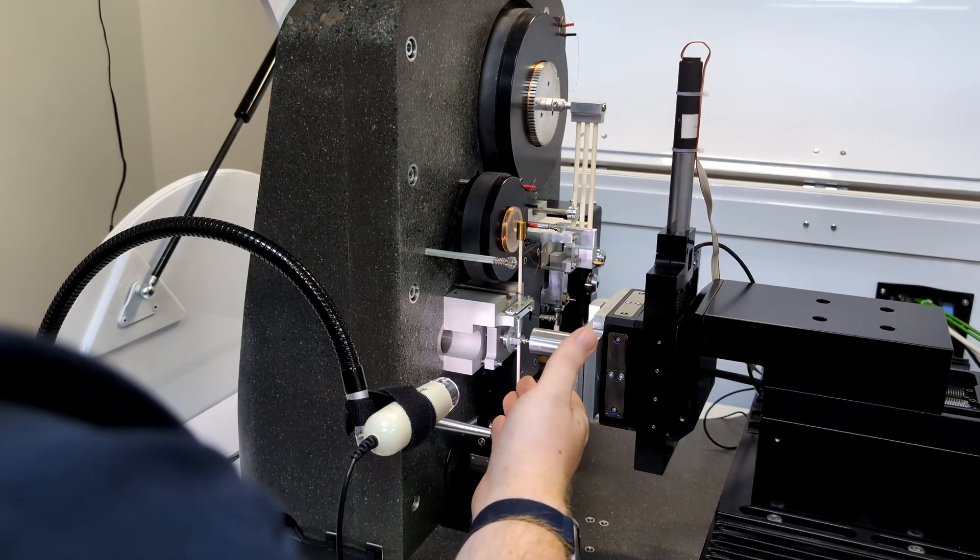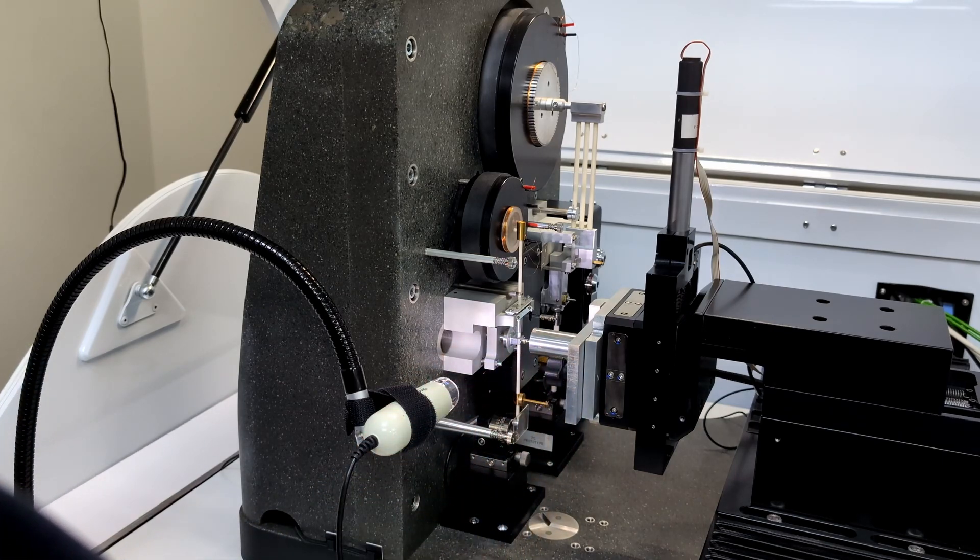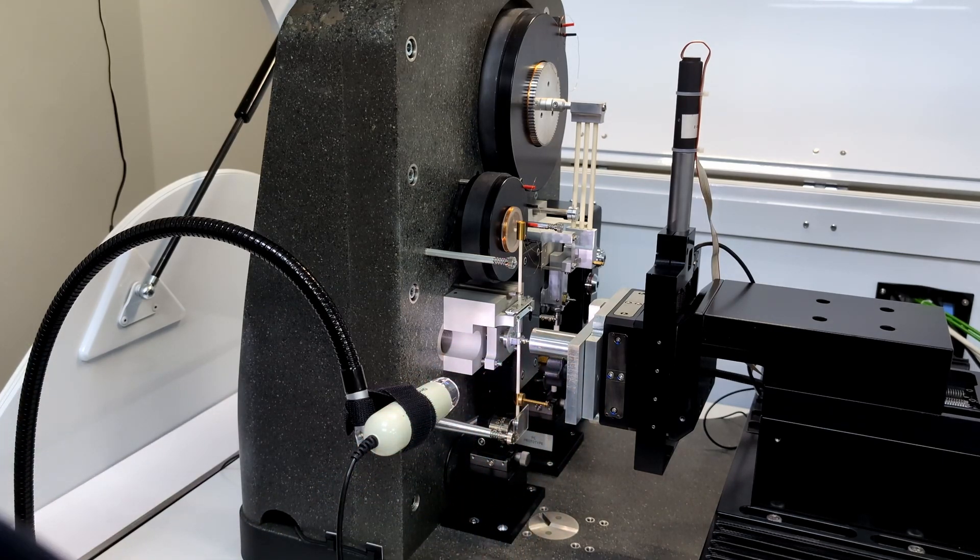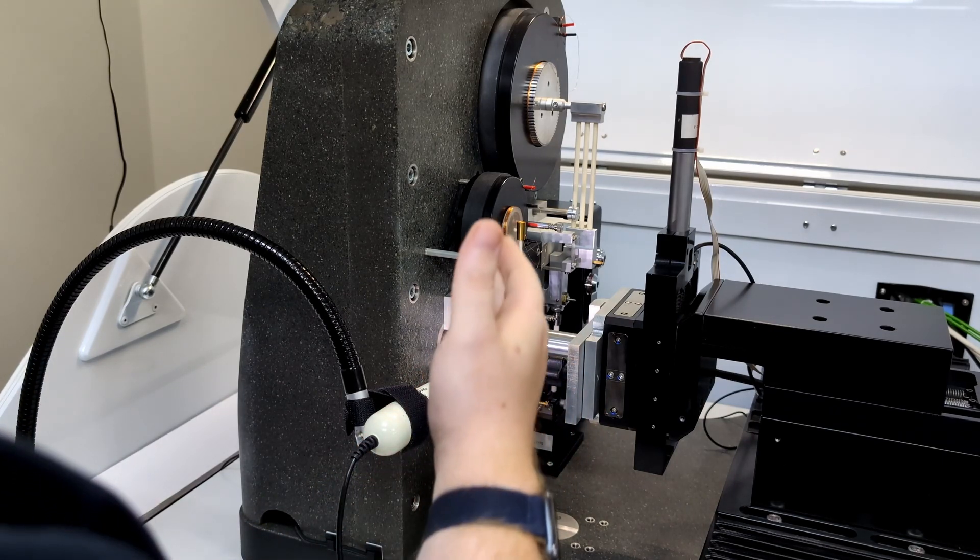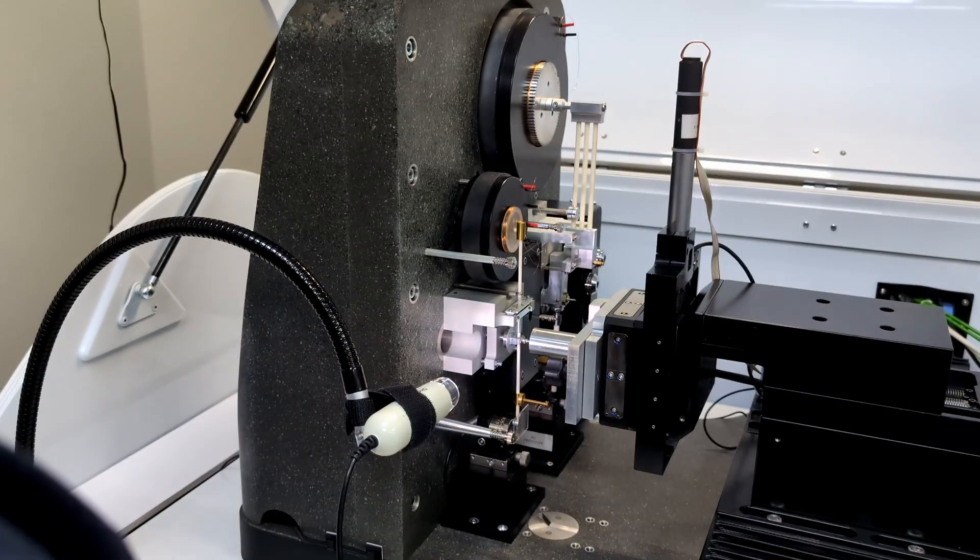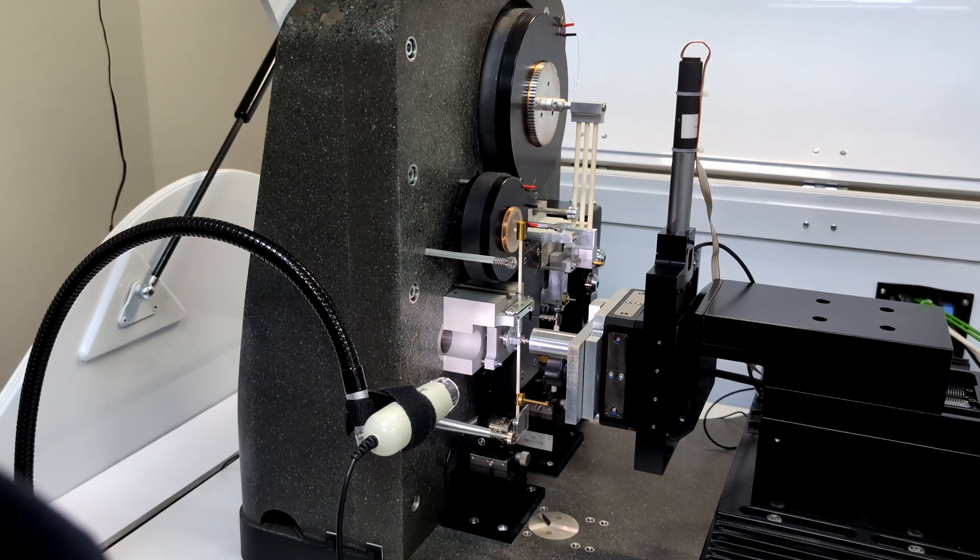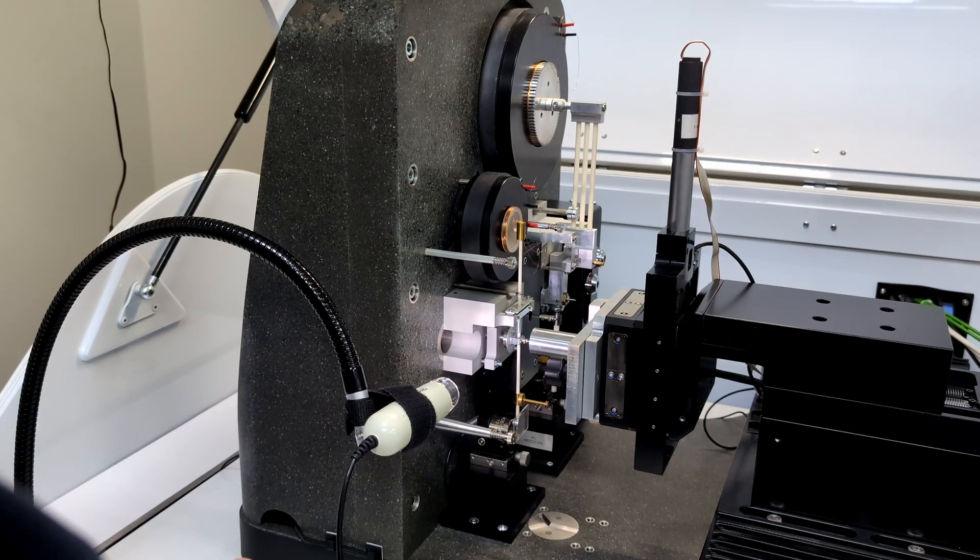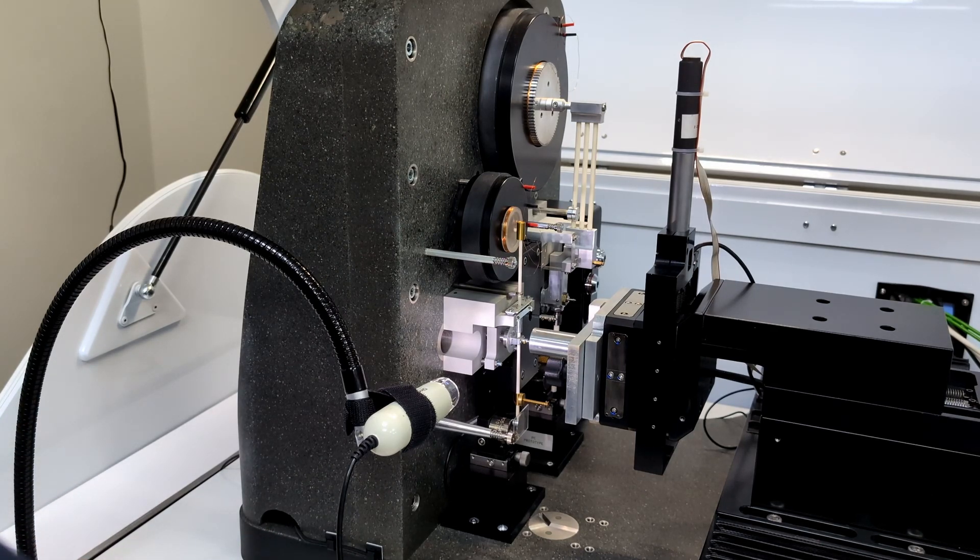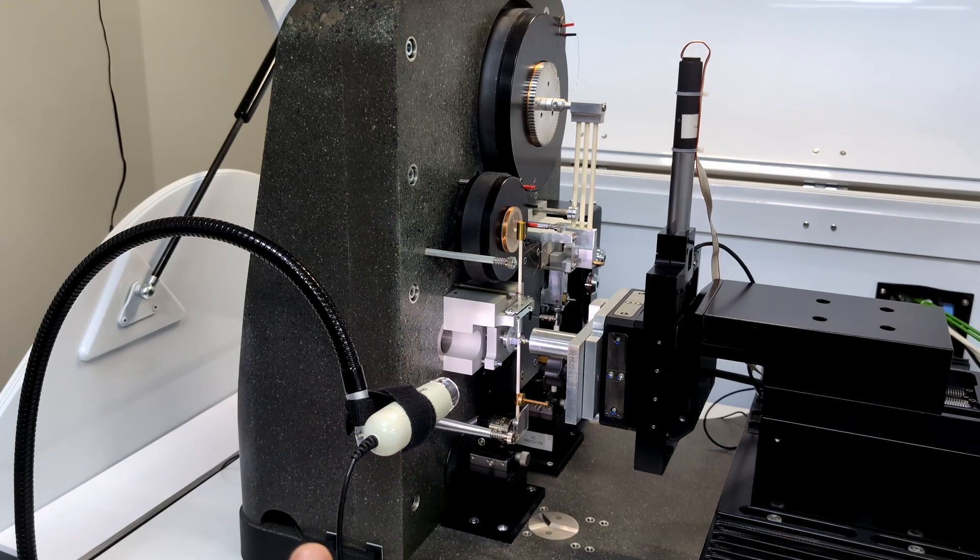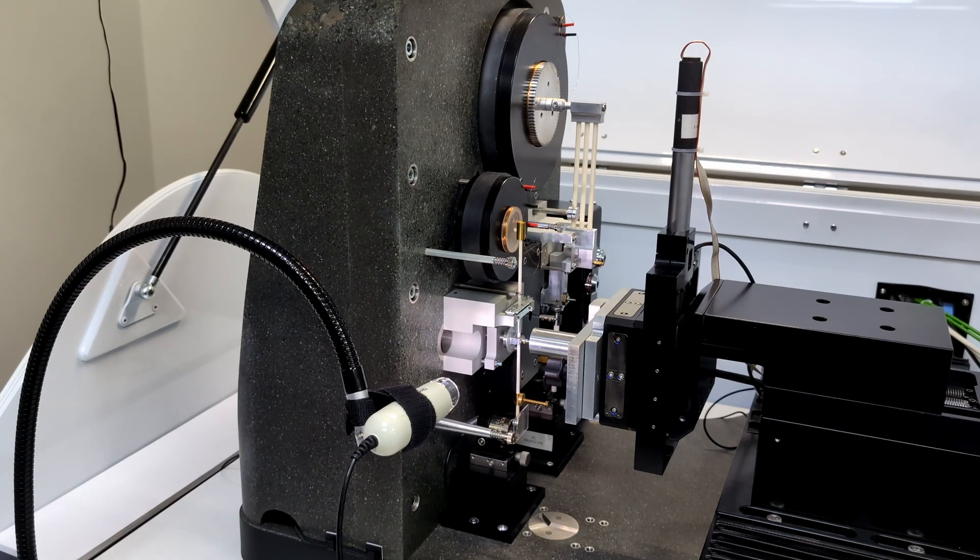The nano loading head, seen here at the front, can achieve static impact loads of 100 millinewtons, and 5 newtons with a micro loading head at the rear. The final impact force will be higher, and depends on other parameters, such as the accelerating distance, which can be up to 24 microns for nano impact, and 70 microns for micro impact.